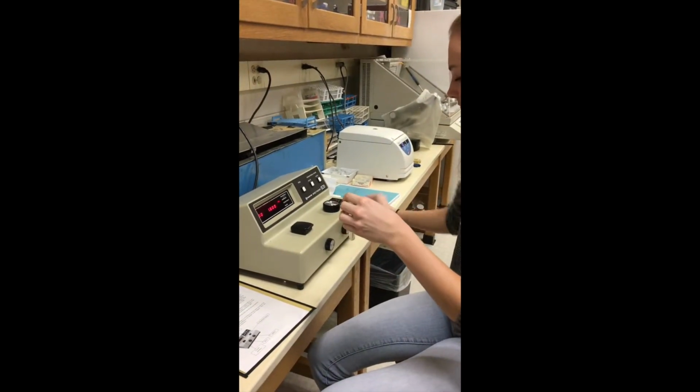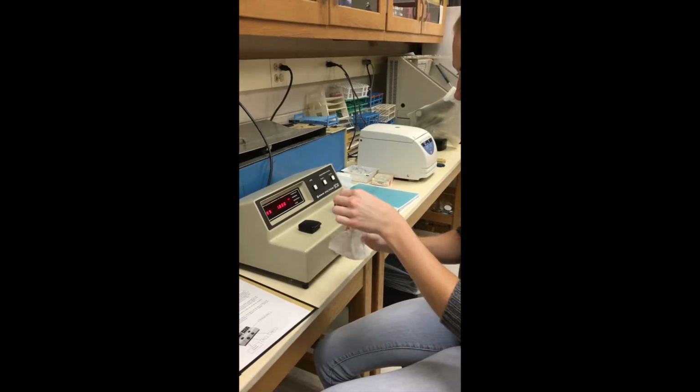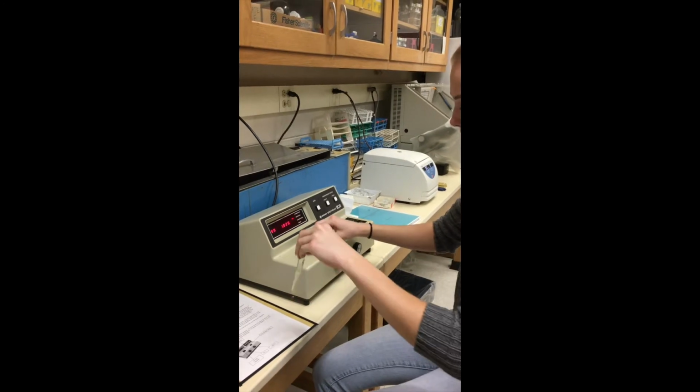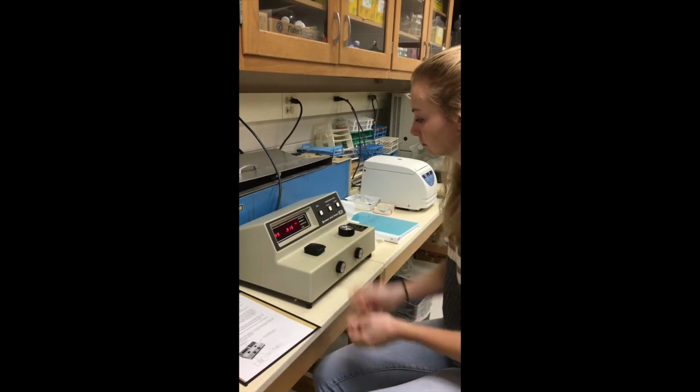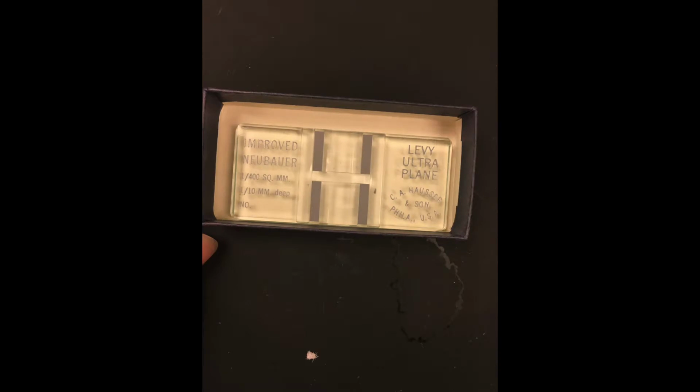Turbidimetry readings were taken every 12 hours for 12 days. The photospectrometer was blanked using a tube with only algae media. Each tube was inverted to allow even distribution of algae cells, and absorbance readings were taken. Cell counts were taken using a hemocytometer.